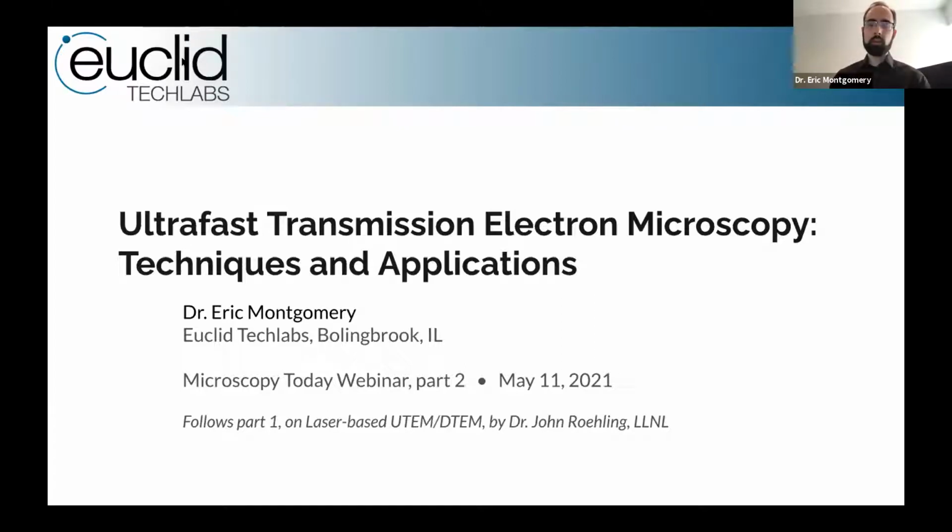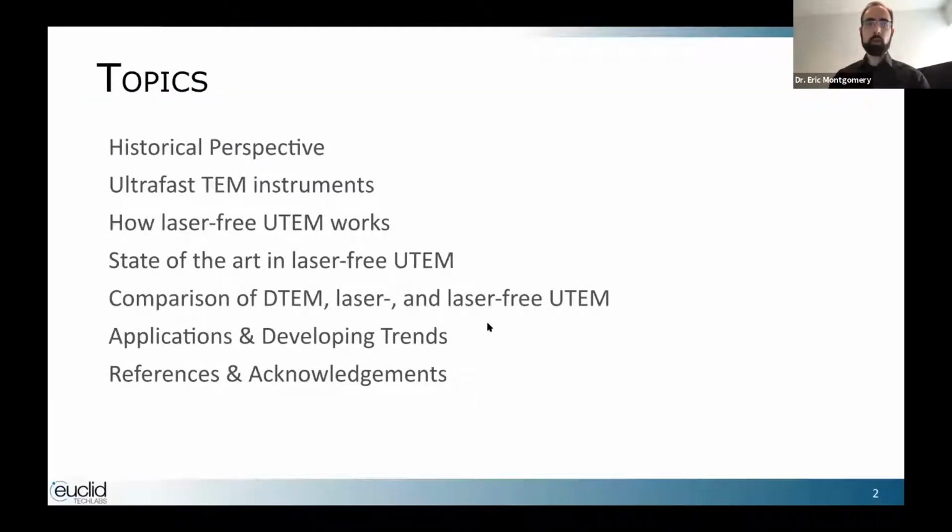Laser-free UTEM is a relatively new development, so I'd like to start off in this presentation with a historical perspective and comparing the different types of ultrafast instruments. This will be a bit of review from John's talk. Then I'll get to the new part, the laser-free UTEM and how it works, the state of the art, and comparing the various methods that are out there with what I hope is a very fair comparison. We'll conclude with some applications and developing trends, and I'd like to put up what I hope are some useful references for our community attending from around the world virtually today. Thank you for your attendance.